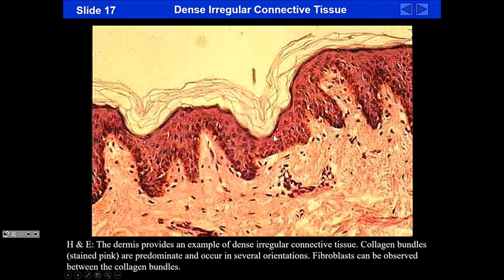Okay. So integument, you'll learn that this is the epidermis and this is the dermis down here. The dermis, the salmon pink layer, is the dense irregular connective tissue, and you can see the orientation, mostly of collagen fibers, in different orientations. So dermis is a good example of dense irregular connective tissue. Irregular in that the cells and the collagen fibers are all arranged in different ways. Question?